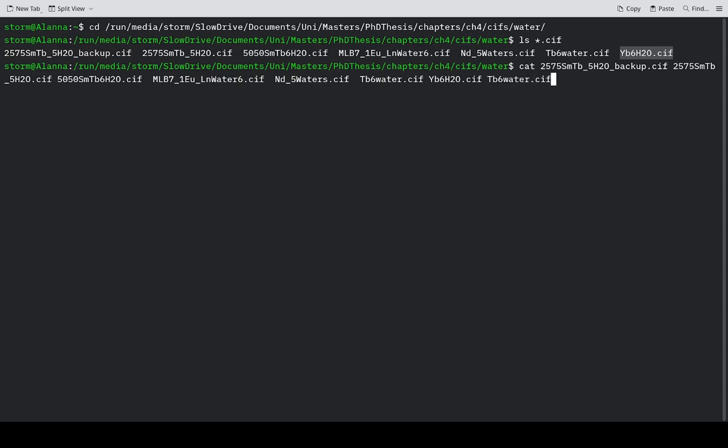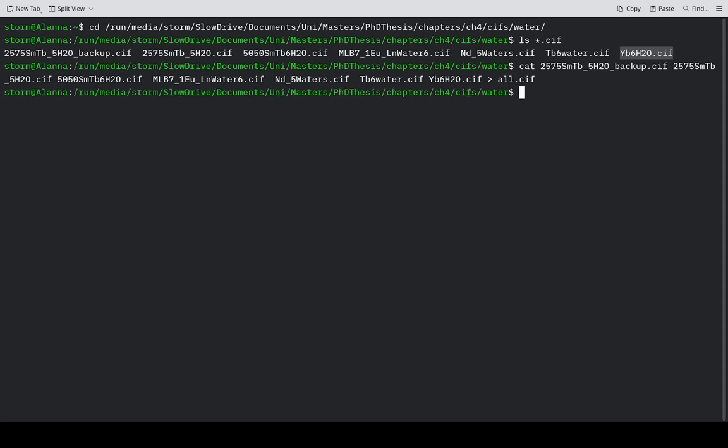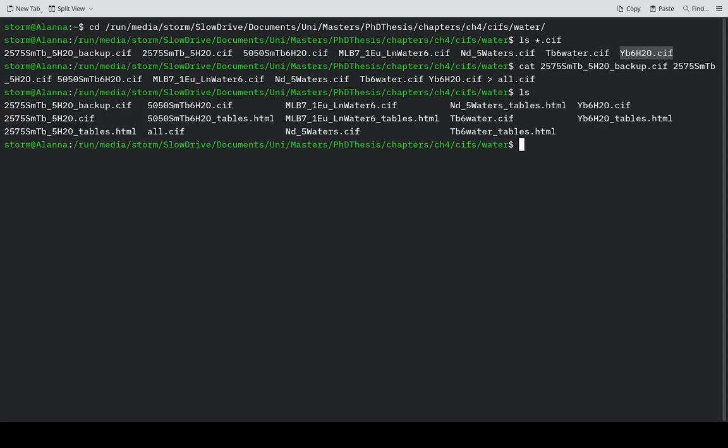That would work fine. That's just by pressing the tab key. Then you type an arrow and say all.cif. Hit enter and you'll see right down here all.cif.